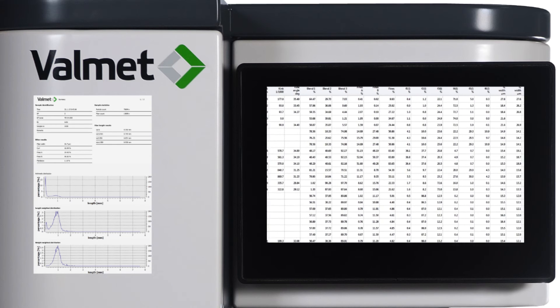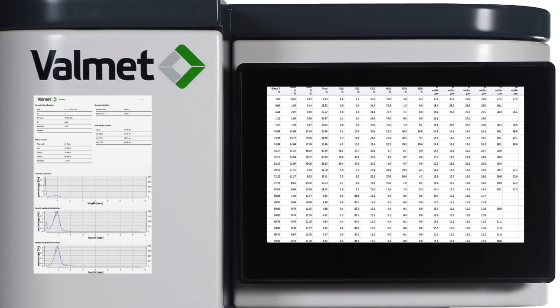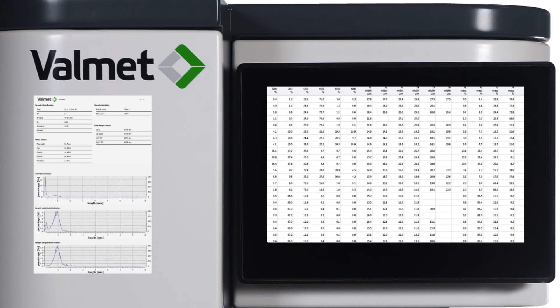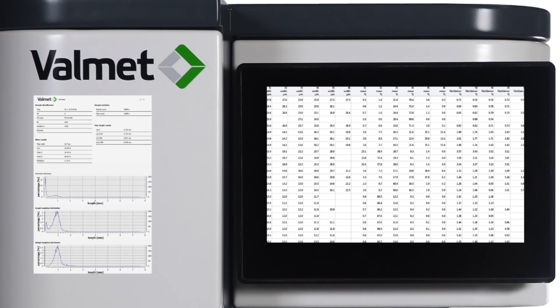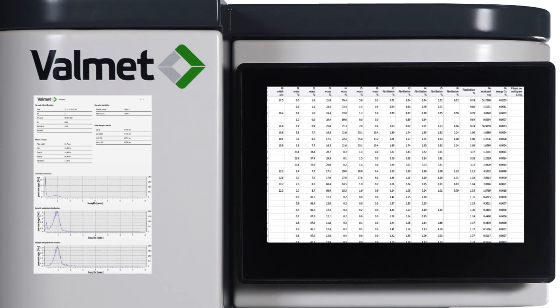The range of results you as a customer gain from our Valmet FS5 fiber image analyzer is exactly as comprehensive as you want and need it to be. We can offer an extensive amount of different results from fiber analysis.